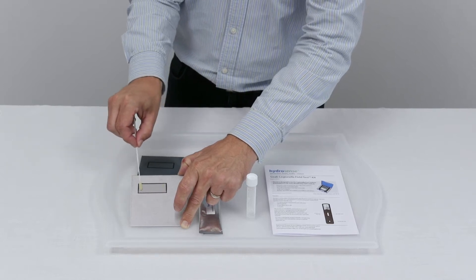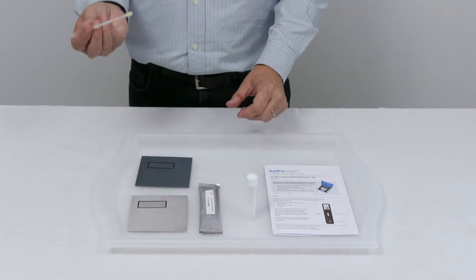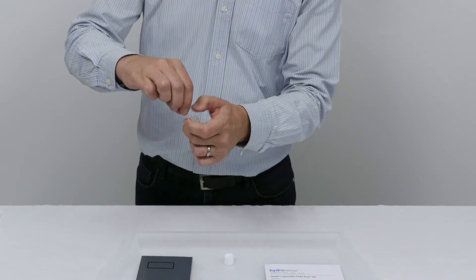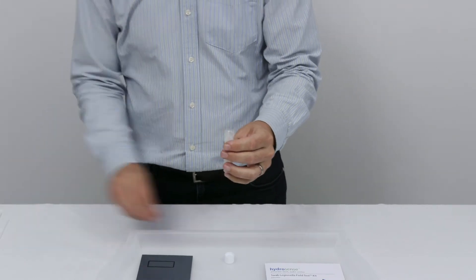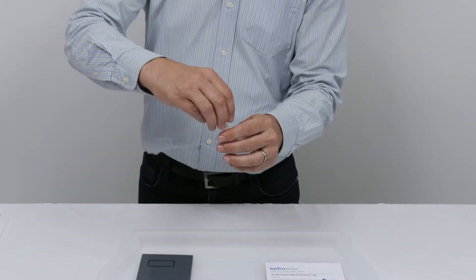Once we've swabbed the area, we can transfer the swab to the vial. On the swab handle there's a red mark, and at that point we can snap off the handle, which allows us to replace the lid on the vial.